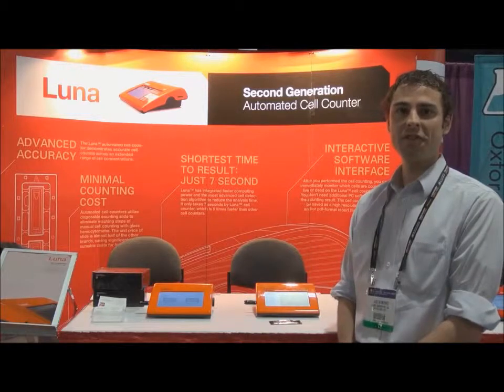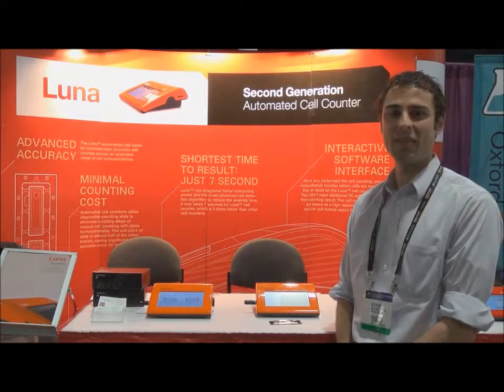In summary, the Luna FL is an automated cell counter without cell counting limitations. It can count blood cells, primary cells, yeast, and just standard cell lines, all in one affordable package. For further information or to request your demo, you can go to logosbio.com. Thank you.